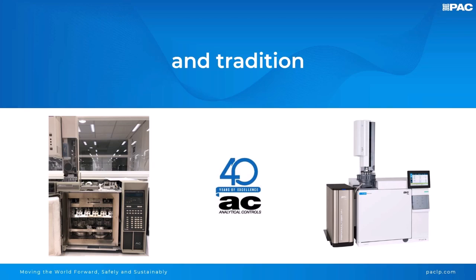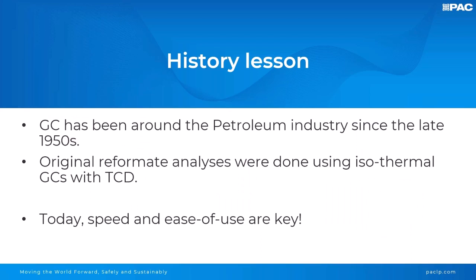Regarding GC as a technique, it was developed in the 1940s and has been noted as being used in the petroleum and oil and gas industry since the 1950s. Early applications were performed with packed columns in an isothermal oven, with detection typically being done on a thermal conductivity detector. These applications typically took hours on end to achieve separation of the complex mixtures, but this helped pave the way for what we see now. In today's laboratories, speed and simplicity are what drives the future.